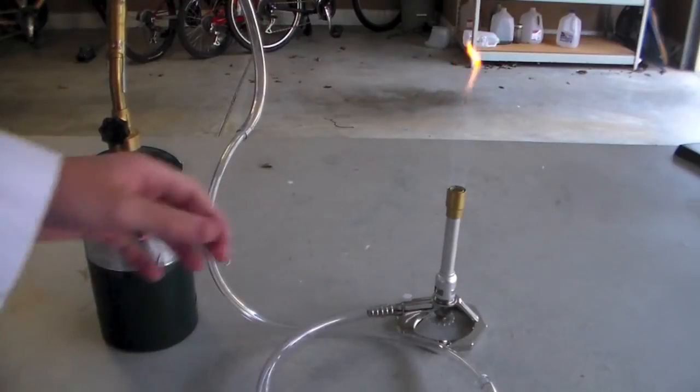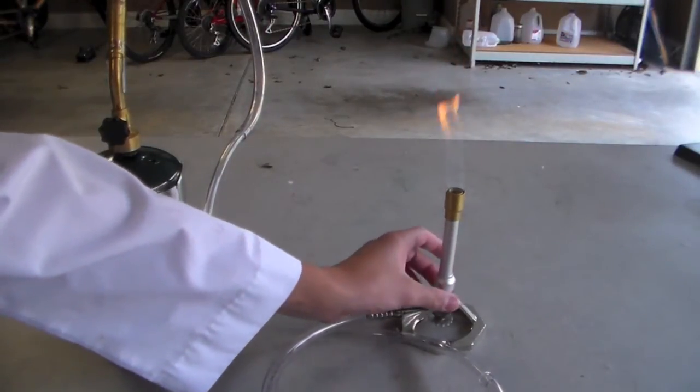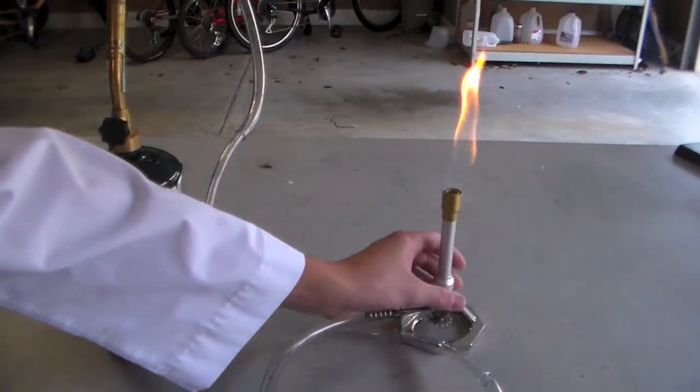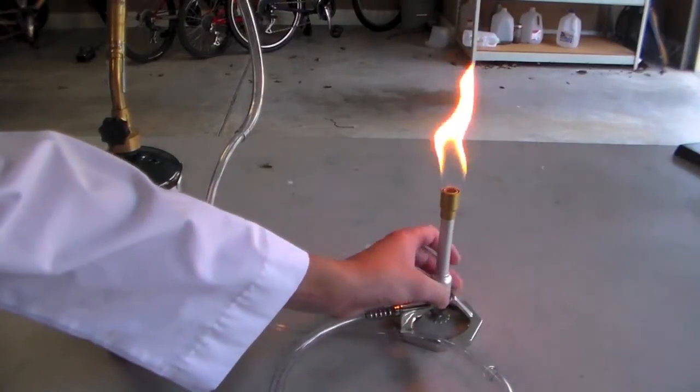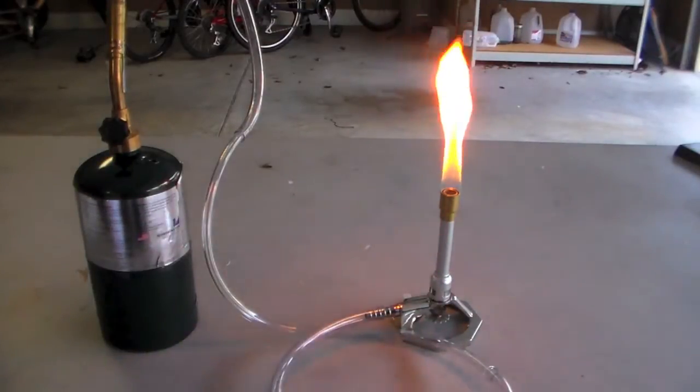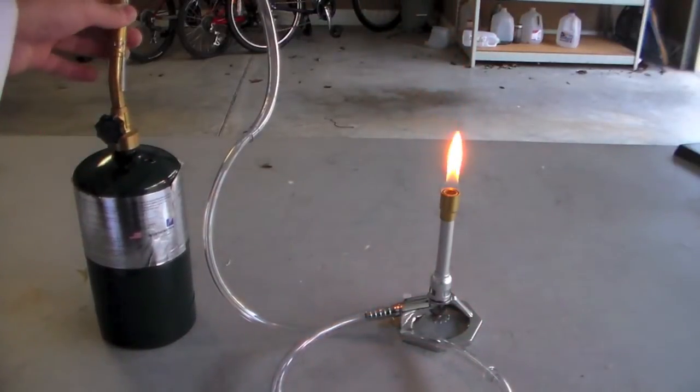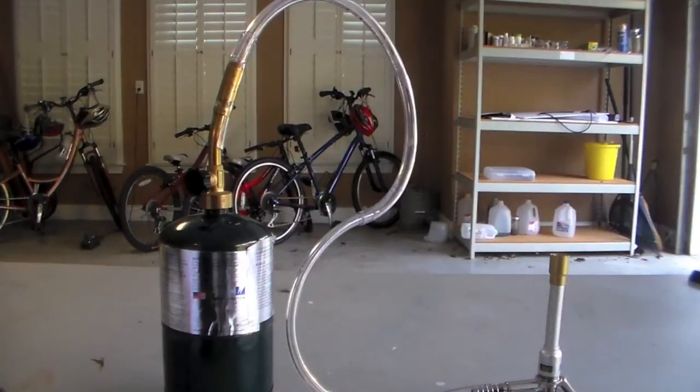Finally, to turn off the burner, what you want to do is first adjust the oxygen on the burner until you get a yellow flame. The yellow flame is the cooler flame—it's still pretty hot obviously, but it's cooler. And then you want to turn the gas off at the torch.